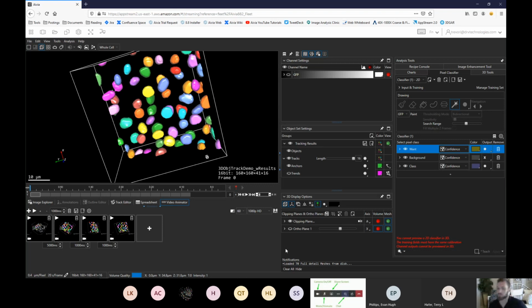So that's all I had planned for you. I hope it was helpful. Again, just a reminder, unless I explicitly stated as I did it, all of this can be done in Aivia Community, which is something that you just download for free, put on any workstation you want, and get to visualizing. And we hope that with that tool you don't have to have a big budget or anything like that to get some really impressive results out.